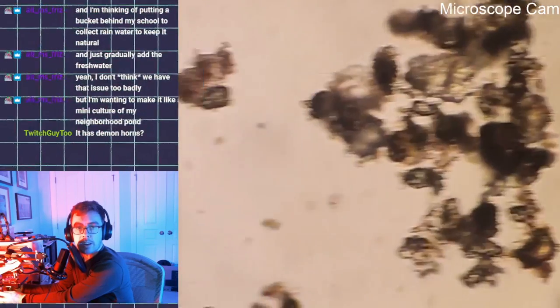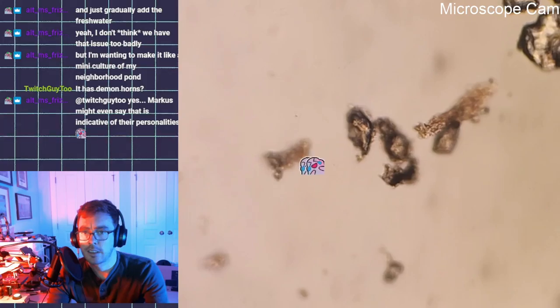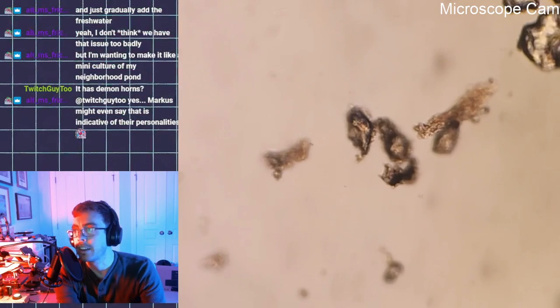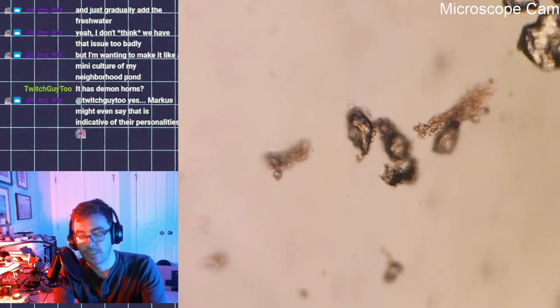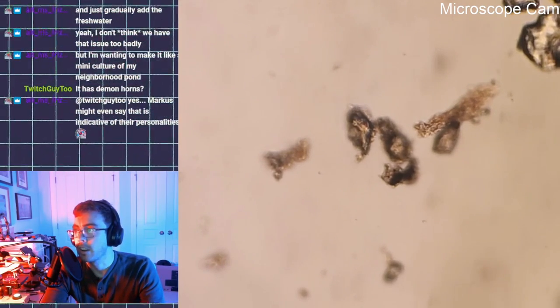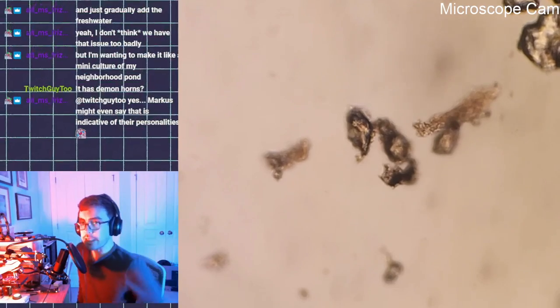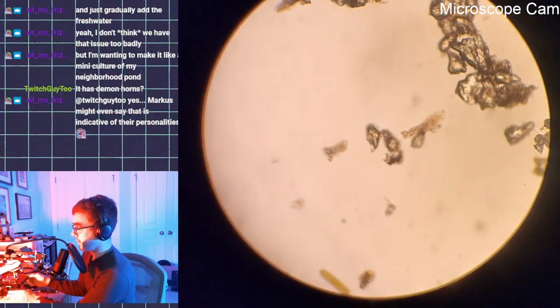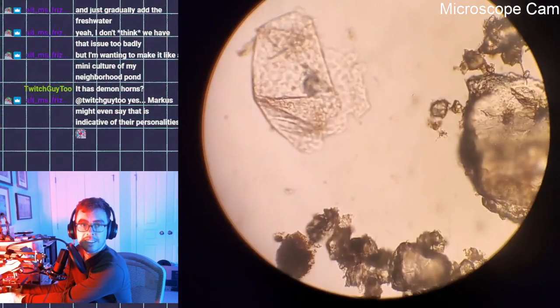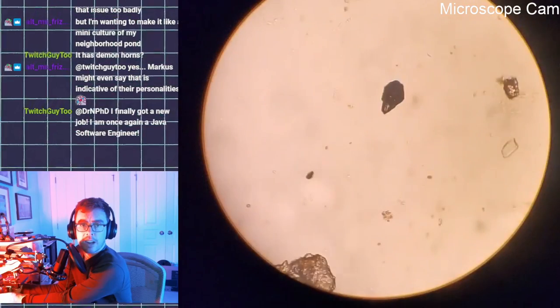So that was a copepod, which is a type of arthropod. I forget, though, what they're most closely related to. Yeah, I would say that. Not a huge fan. They're the reason my first tardigrade culture collapsed. At least I think so. Okay, they're freshwater crustaceans, which means by default they are arthropods. But more specifically, they're crustaceans. That's cool. Oh, and then our diatom is still chugging along right there. Our hypotrich.